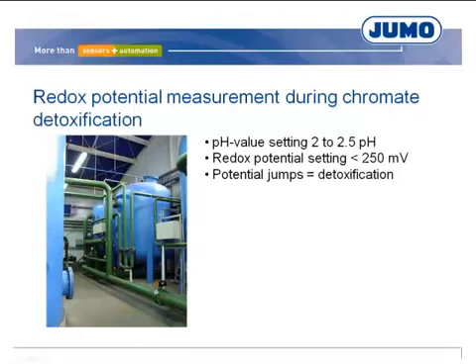Over time, the reducer and the acid are depleted. Both are readjusted. The detoxification process is complete when no further potential jumps occur after the reducer is added. Finally, lye is added to neutralize the wastewater.